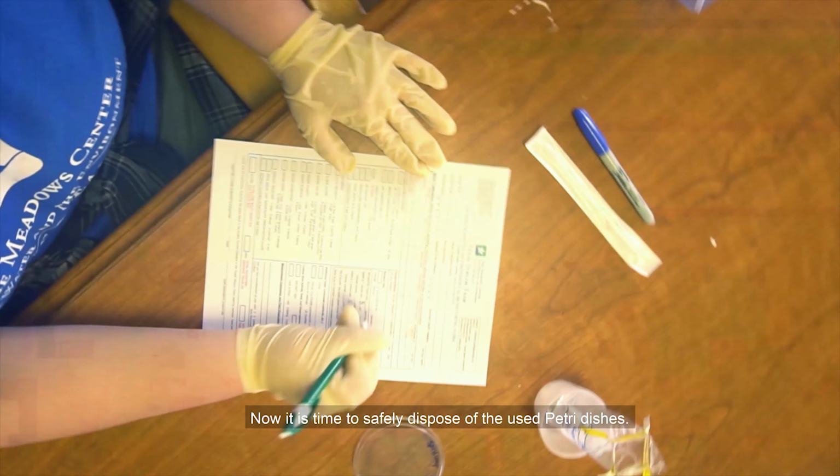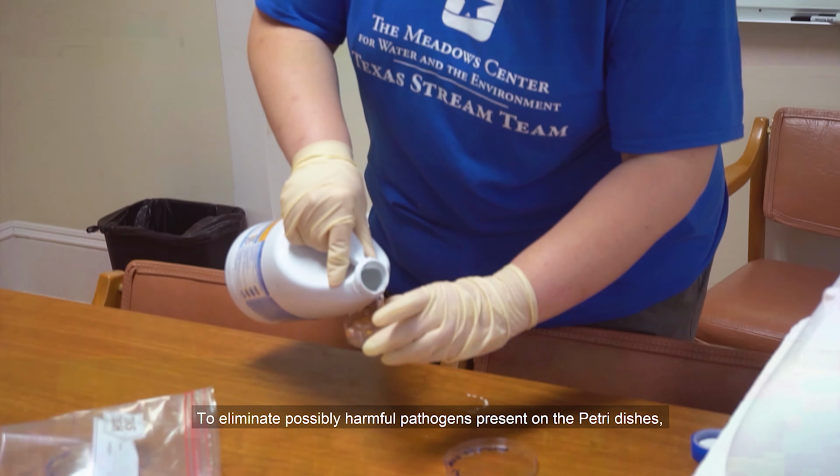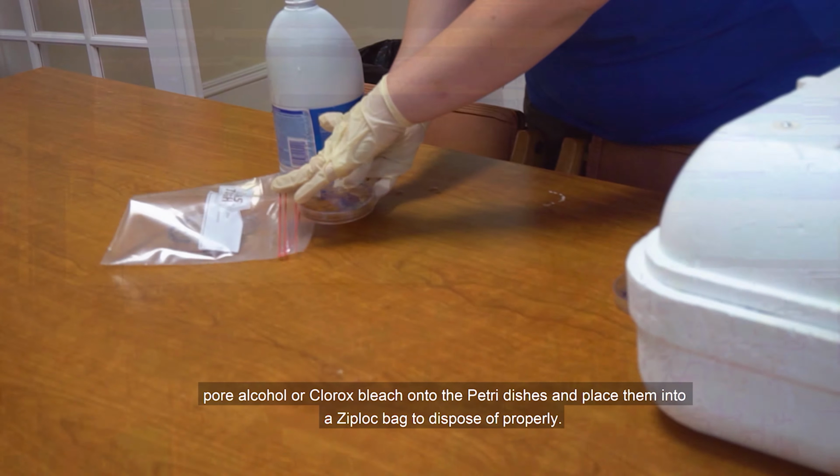Now it is time to safely dispose of the used petri dishes. To eliminate possibly harmful pathogens present on the petri dishes, pour alcohol or Clorox bleach onto the petri dishes and place them into a Ziploc bag to dispose of properly.